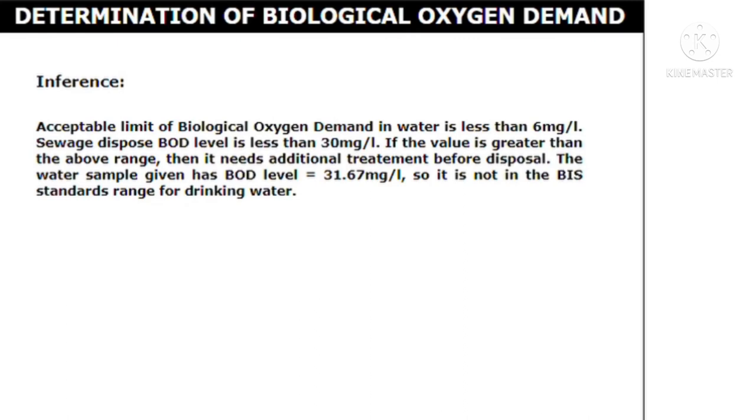The water sample given has a BOD level of 31.67 mg per liter, so it is not in the BIS standards range for drinking water.